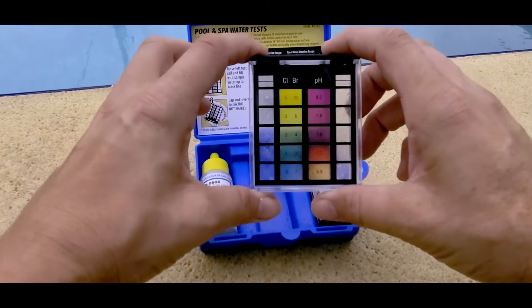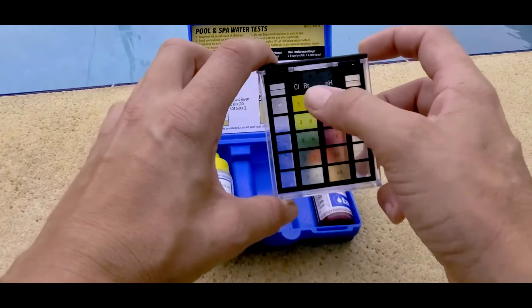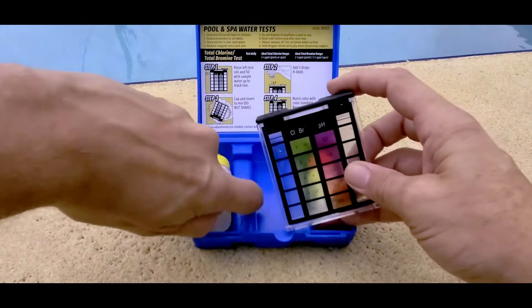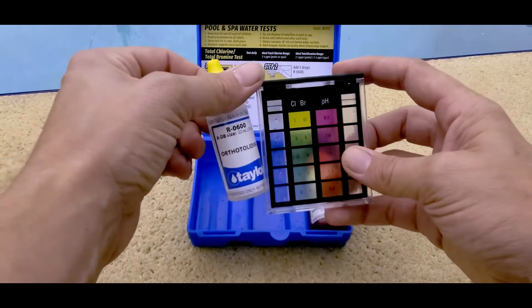So it's pretty simple. All you have to do is fill it up to the little lines here with pool water. And then you take this solution for the chlorine, and you just add five drops of this.